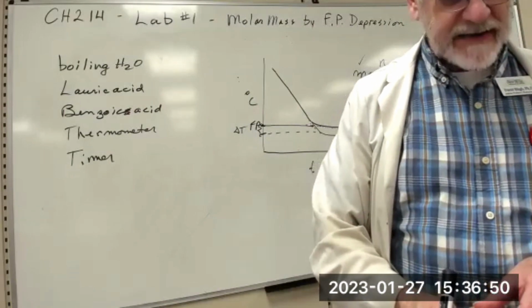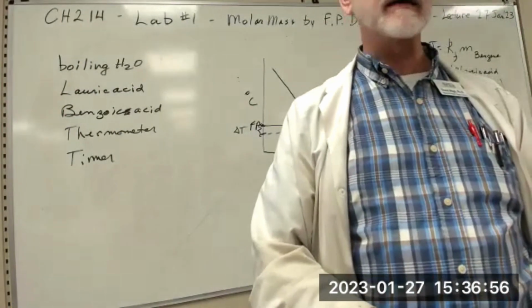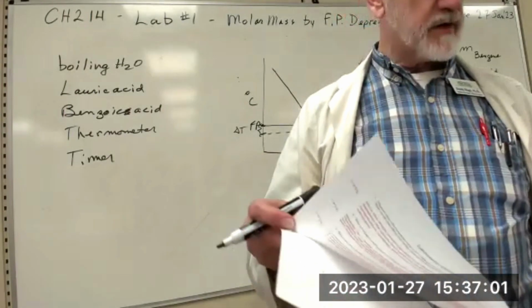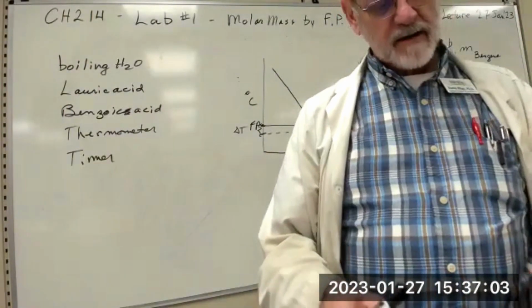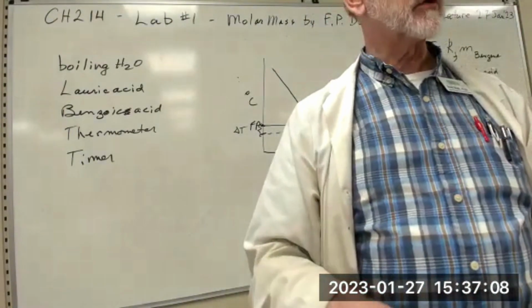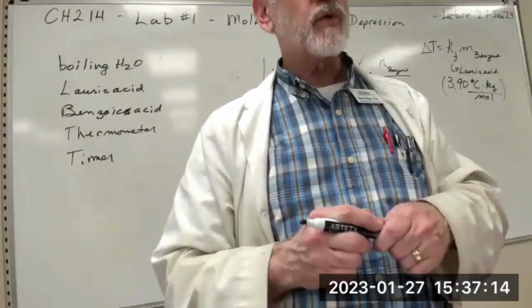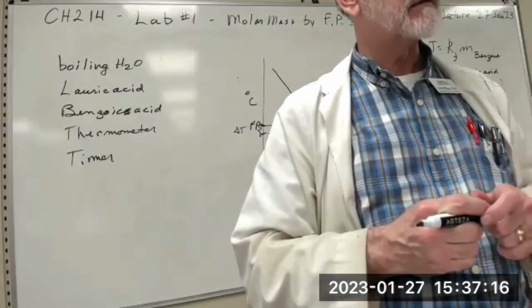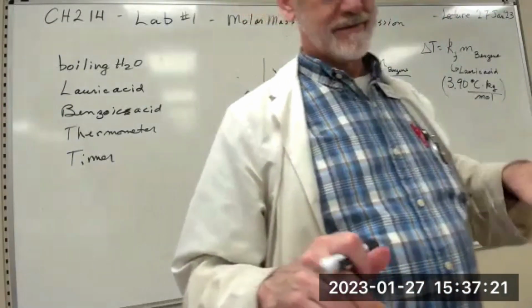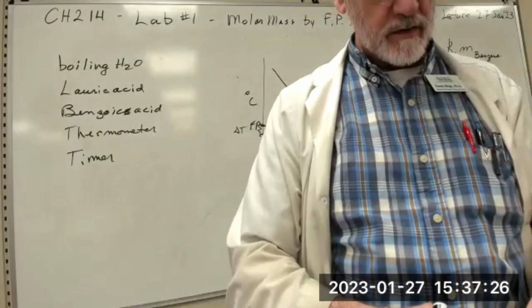Okay, so that's why activity 1 and activity 2. The first, activity 1, is pure solvent, and activity 2 is the mixture. And then you've got tables over here to help you fill it out. But what I would do is just transfer that table into your notebook, because you're going to be using your notebook, not this thing. Okay, do we need to do the pre-lab question, or you think you can do that? I described the whole procedure right here. Oh, discussion questions. Those are the ones that I'm supposed to do with you.